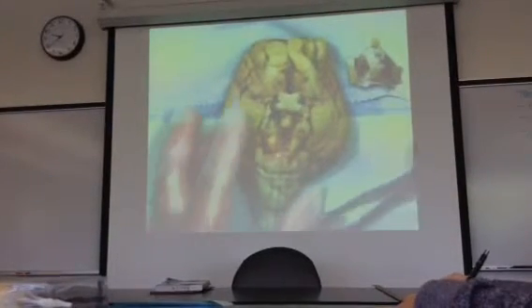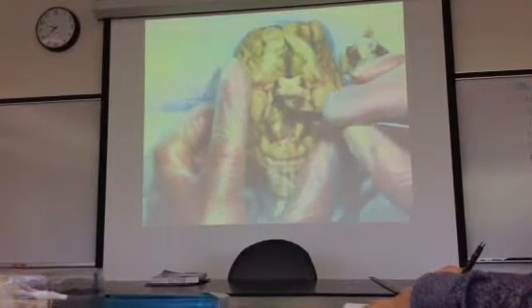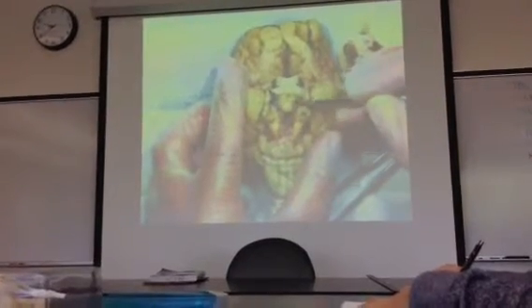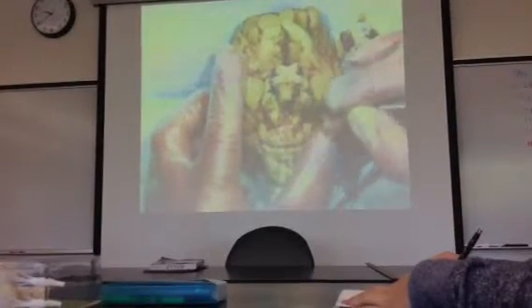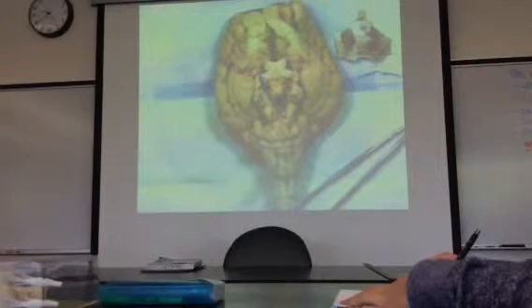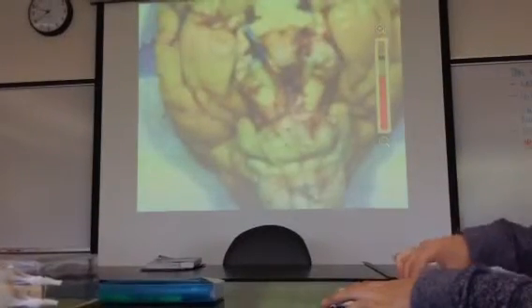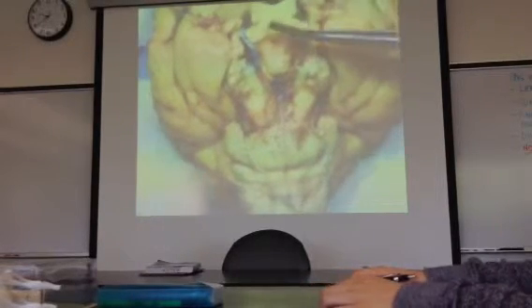And now we can see what else needs to be seen here. I'm just going to push around some of that pia mater just to help reveal some things a little bit better. Okay. Let me zoom in. So we're zoom out. Focus, there we go. So do you guys see, here's that X?